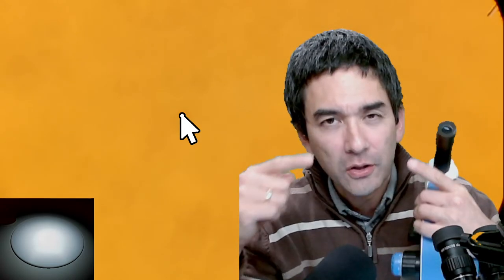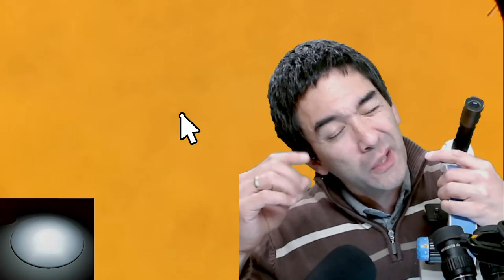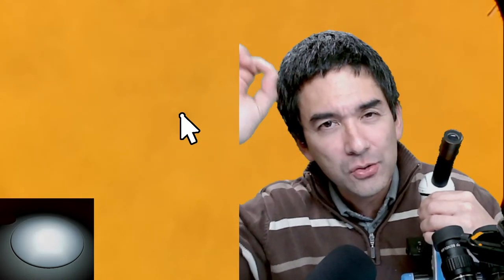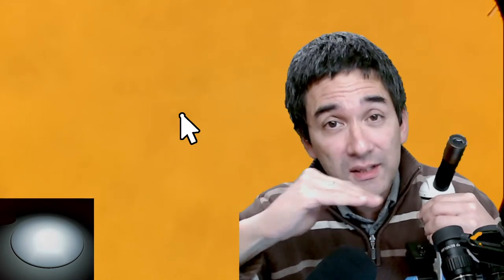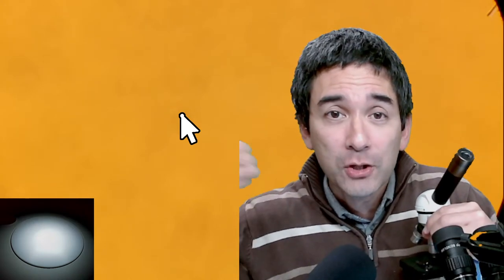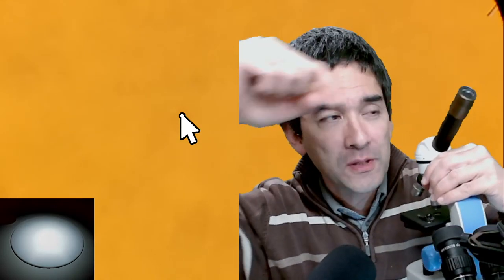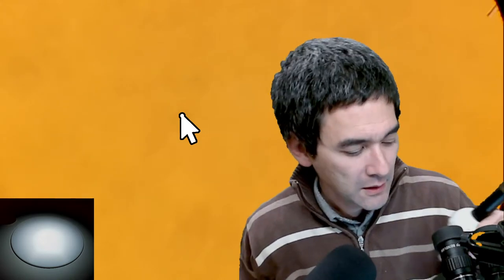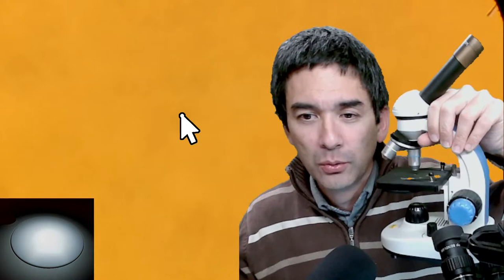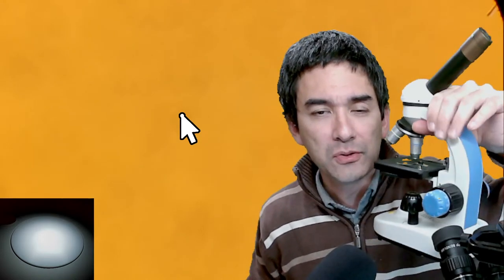Many compound microscopes have two eyepieces for convenience so you don't have to close one eye, but even with two eyepieces it is not a stereo microscope — both eyes receive the same picture and you still see a flat image. Stereo microscopes, the topic of today, give you a three-dimensional, stereoscopic impression. So even with two eyepieces, a compound microscope does not give you a 3D image.